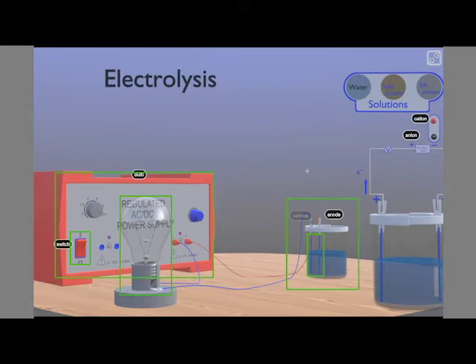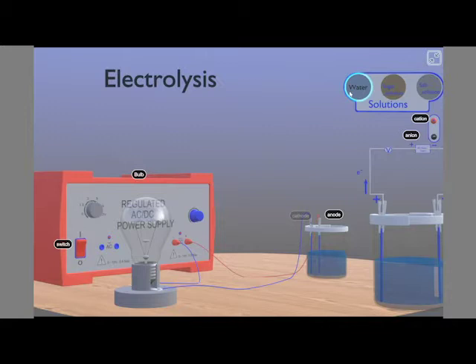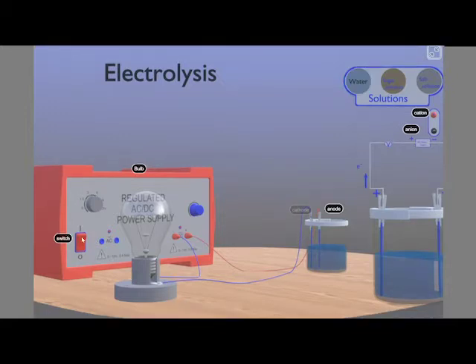Now, let us see how different solutions behave when electric current passes through them. Let's start with water. What happens when we switch on the power supply? You can see the power supply now is on. You can see the green light here. When it is off, there is no green light. So let us switch on to supply the power and see what happens when we are using water.